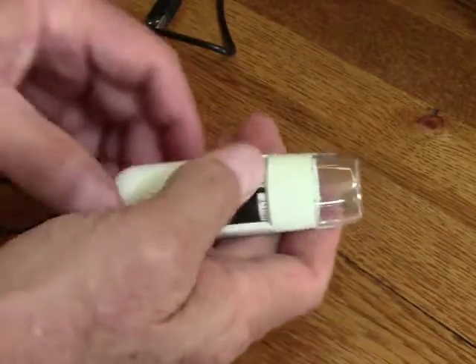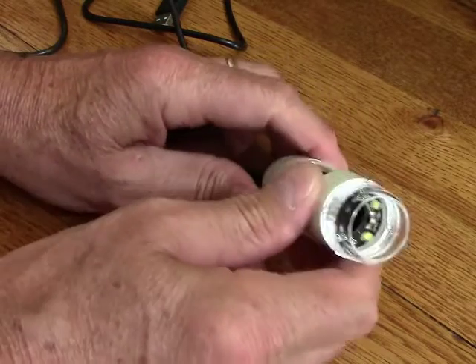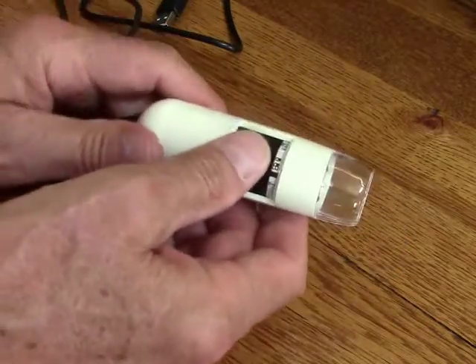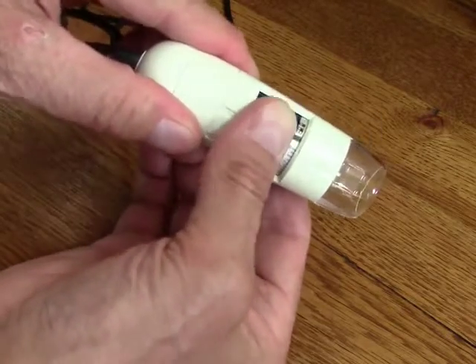This is just very simple to use. You have lights in the end here which light up and that illuminates the object that you want to look at. And then you simply have a focus wheel here.